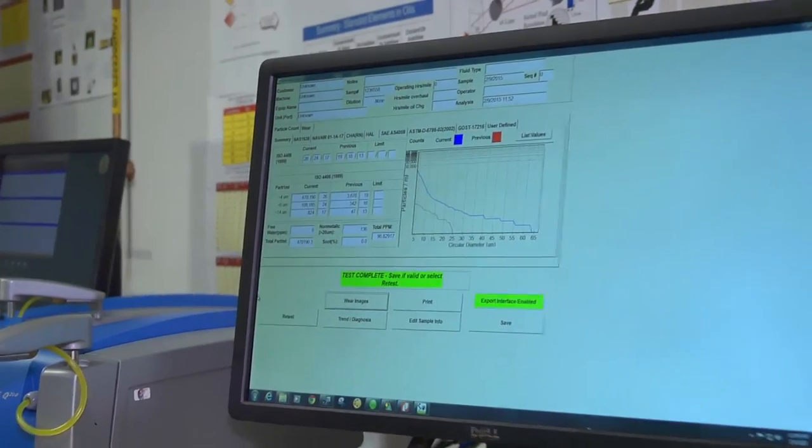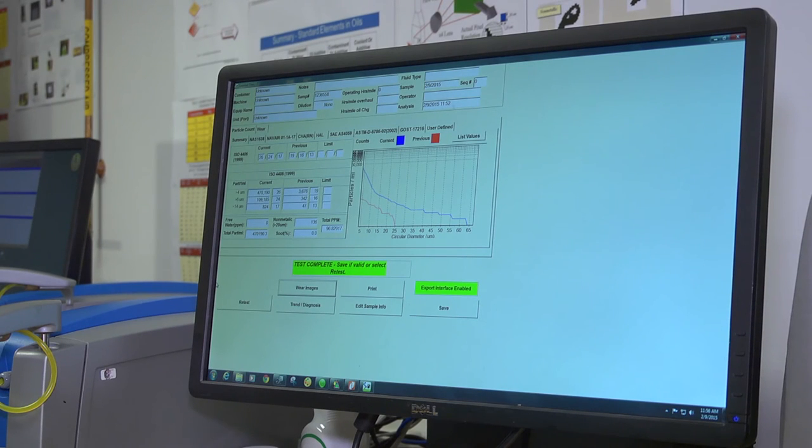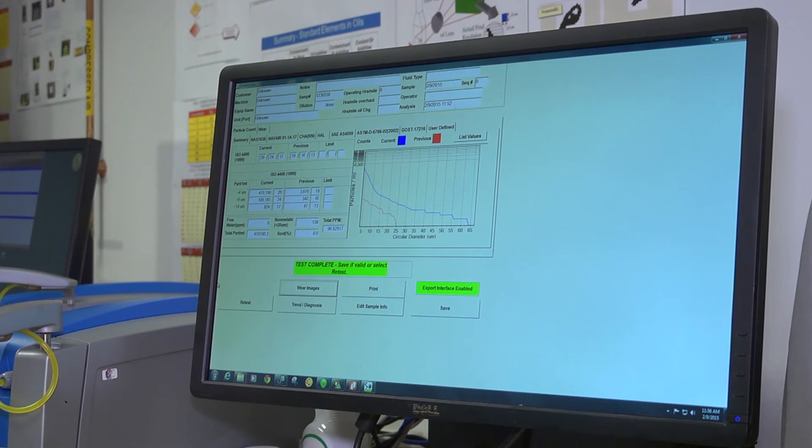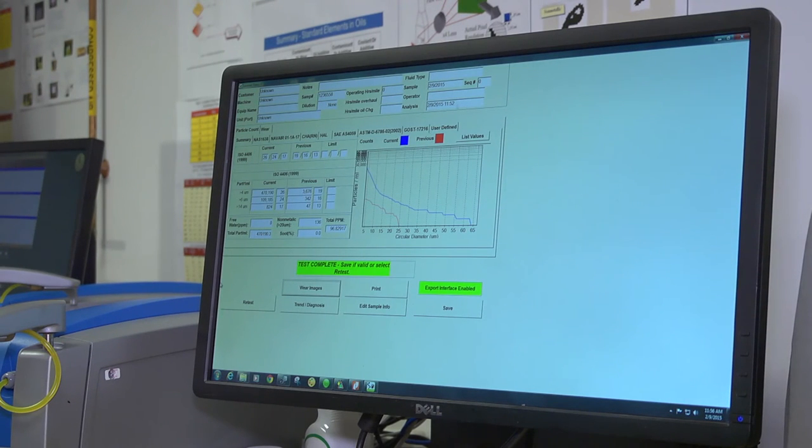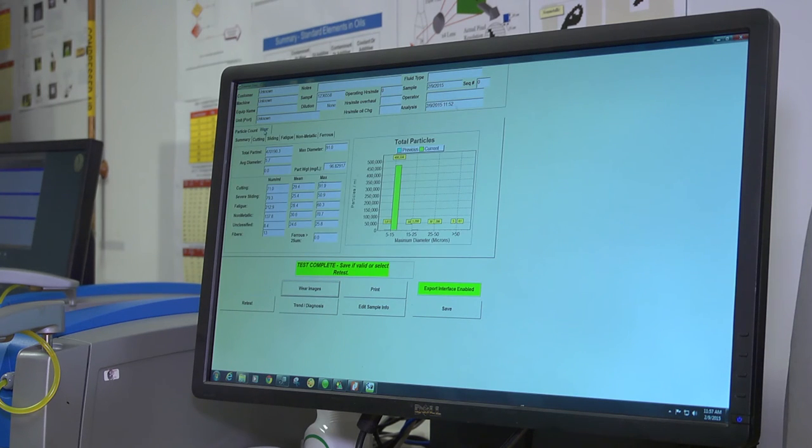We've covered the particle count in terms of the basic ISO codes. Now, the capabilities of the LNF to be a wear monitor is accomplished two ways. I talked briefly about the two types of magnetometers. One gives a total ferrous measurement in parts per million, and the other gives the actual ferrous particle count to complement your total particle count.